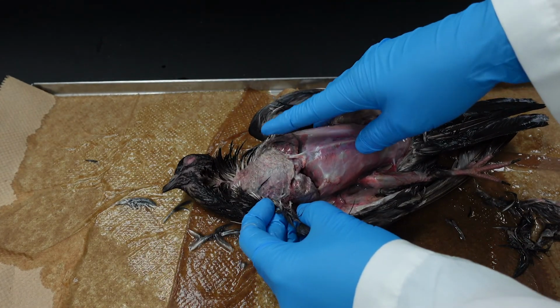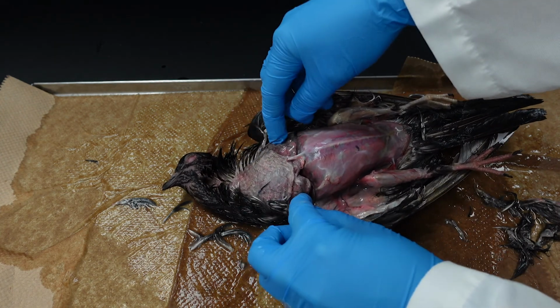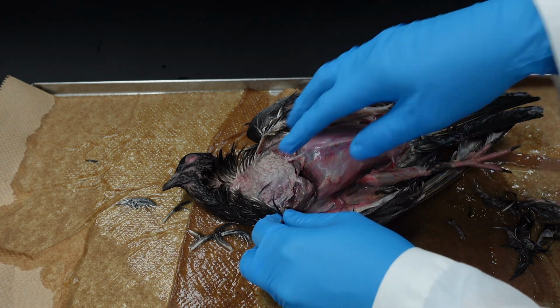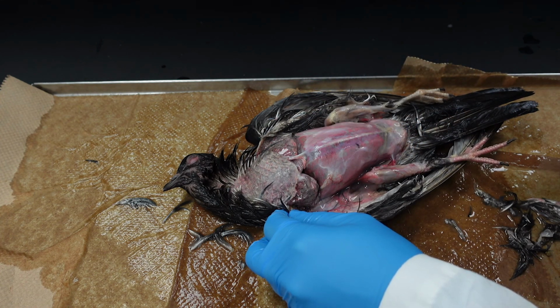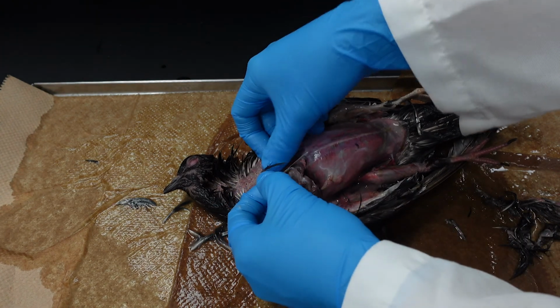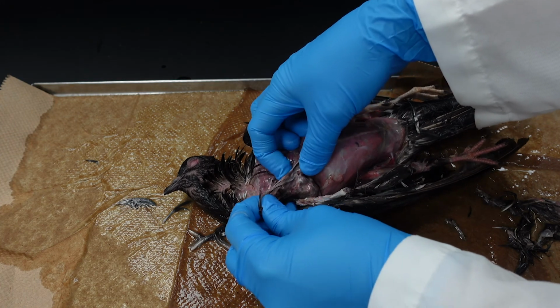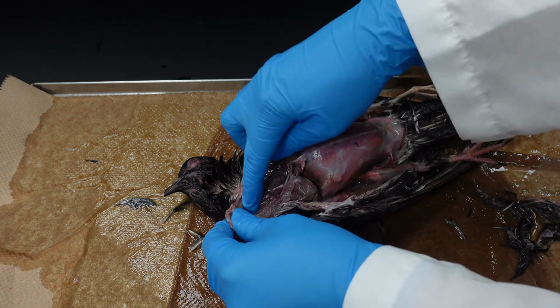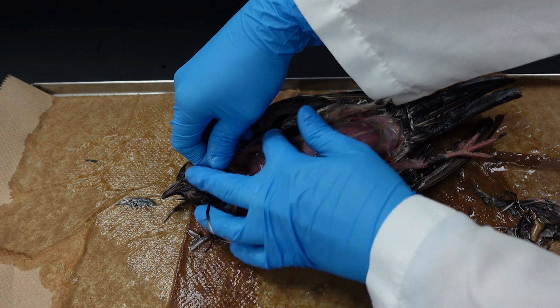Again, we can see this particular bird's crop is really full, and I can feel seeds in there. That may be getting in our way, so you can cut a slight incision and empty the crop. And the skin may be adhering fairly tightly to that surface structure, so I'm going to be a little bit careful. And if it feels like it's too tight, you can leave the skin attached, and don't worry about it. Just make sure to get the feathers off.